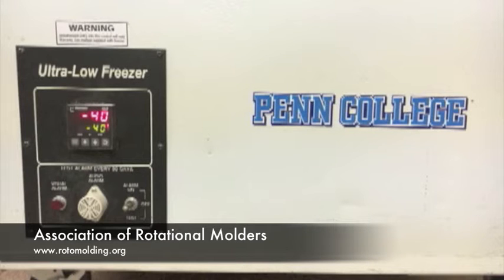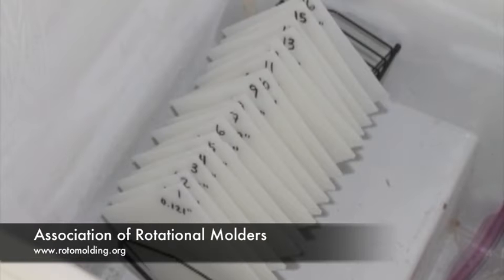These test specimens are conditioned at negative 40 degrees Fahrenheit for no less than two hours prior to testing.